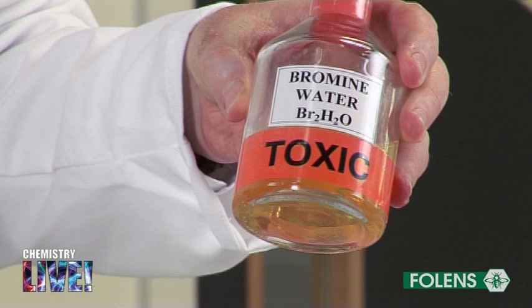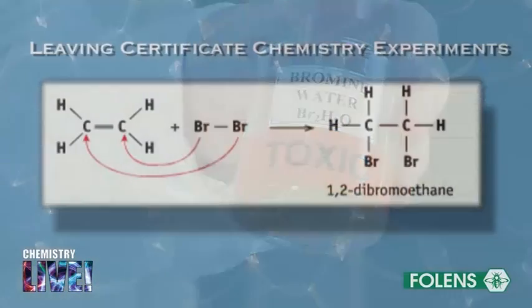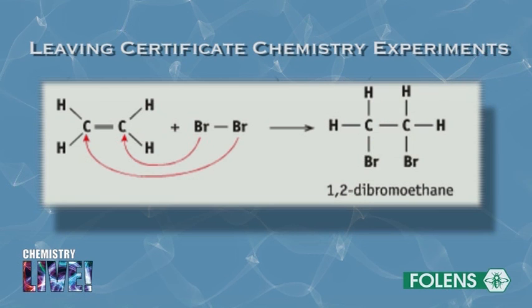Addition of bromine. Alkenes are more reactive than alkanes because of the presence of the carbon-carbon double bond in alkenes. For example, bromine adds across the carbon-carbon double bond to form a colorless oily compound called 1,2-dibromoethane.